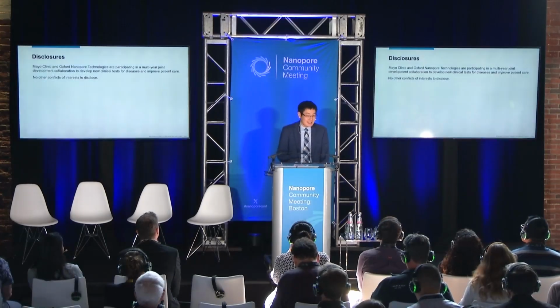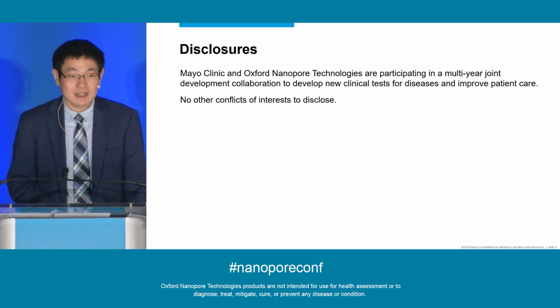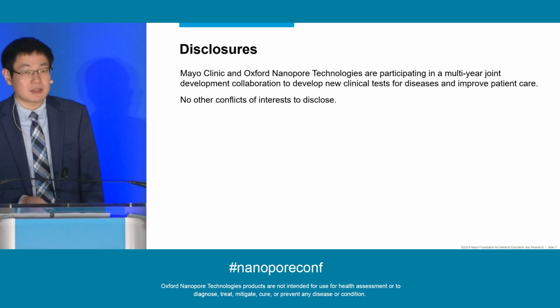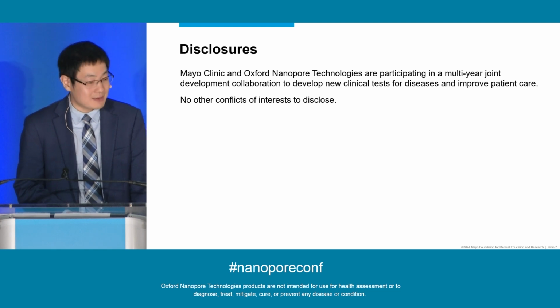My name is Andy Ding. I am a laboratory genetics and genomics fellow at Mayo Clinic. Today, I am excited to talk about using nanopore long-read sequencing to resolve intragenic duplications involving the DMD gene.